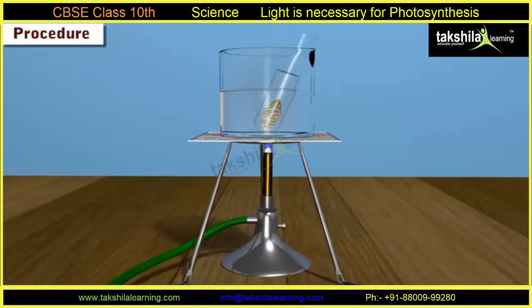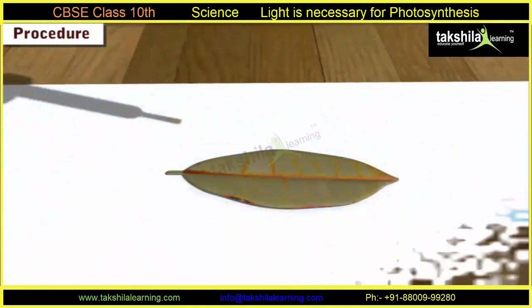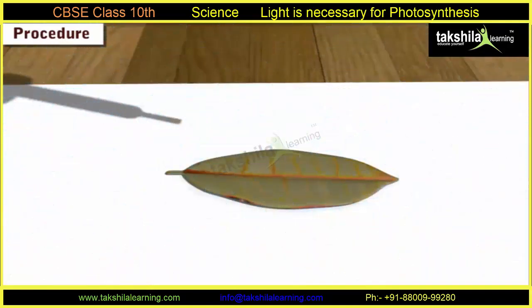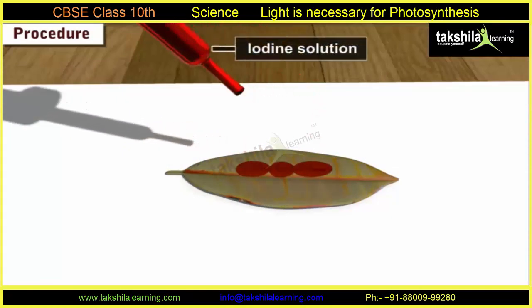Step 6: Dip the leaf in alcohol placed in a hot water bath to decolorize the leaf and remove the chlorophyll. Now the leaf becomes colorless. Step 7: Using forceps, dip the decolorized leaf again in hot water to make the brittle leaf soft. Step 8: Place the leaf on a white tile and add a few drops of iodine solution using a dropper.